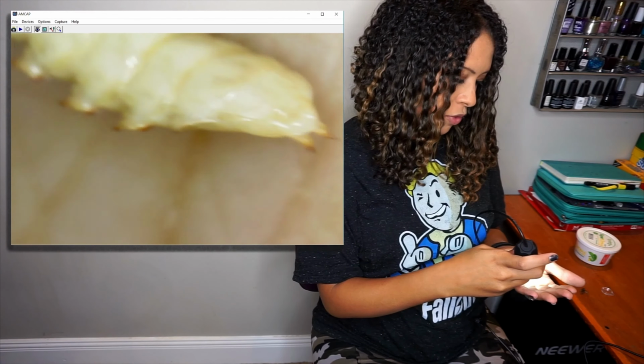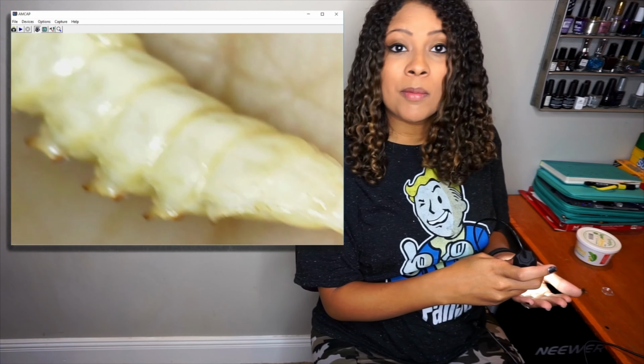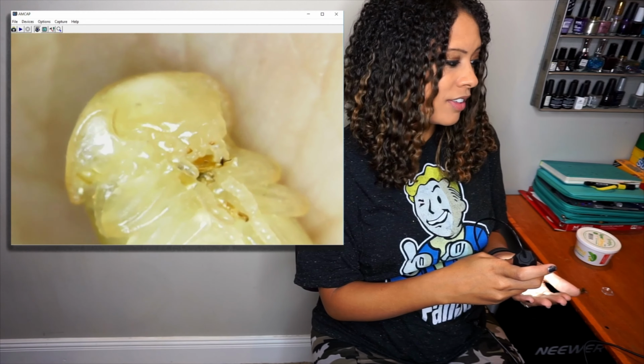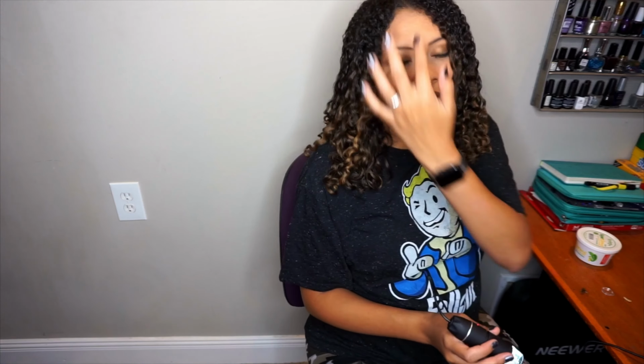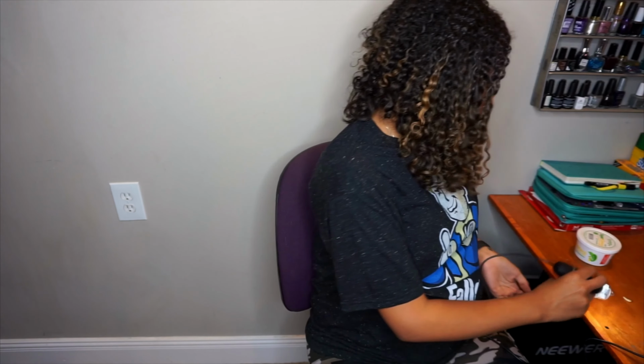This is the stage before that, and as you can see, they are very much alive and they move around. They look like little hatching aliens, and they're super creepy. And I was able to find a freshly dead cricket, which, I mean, isn't that hard? If you guys have crickets, you know they die nonstop. So we're gonna look at that under the microscope. I don't really want to touch it, so we're just gonna keep it on the desk.